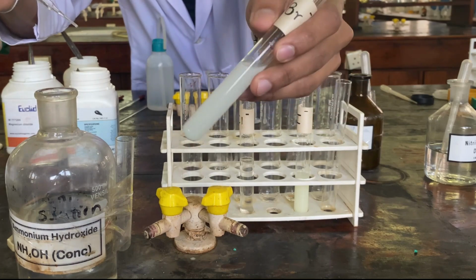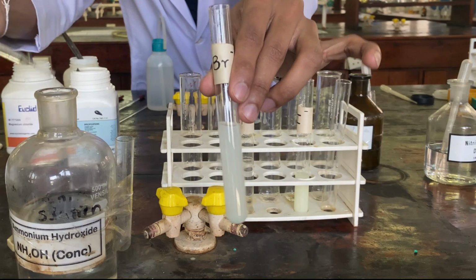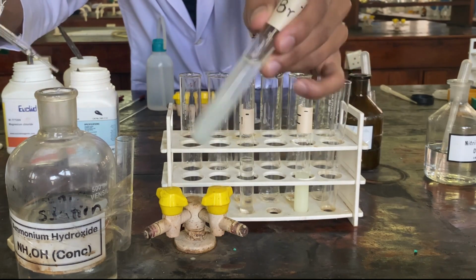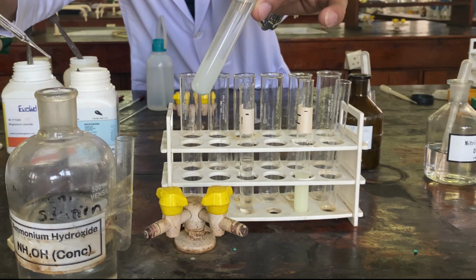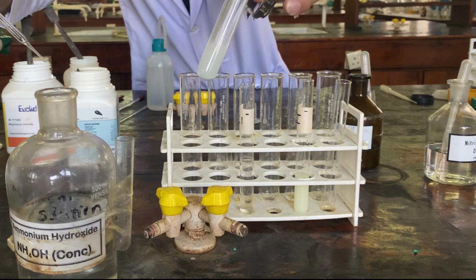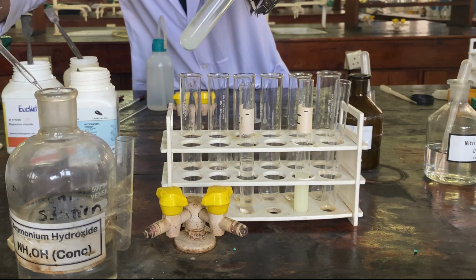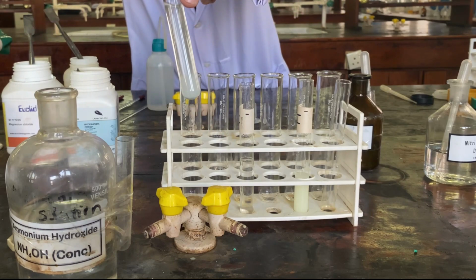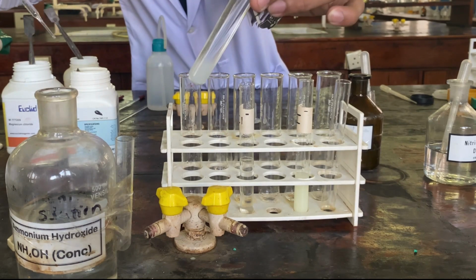Here we are adding concentrated ammonium hydroxide. Shake well. Here you can observe the dissolvedness of the formed precipitate.